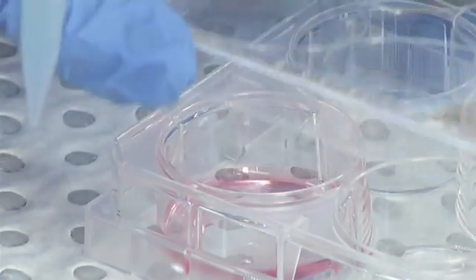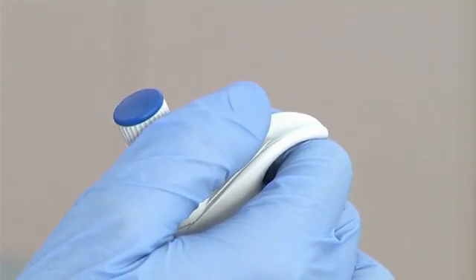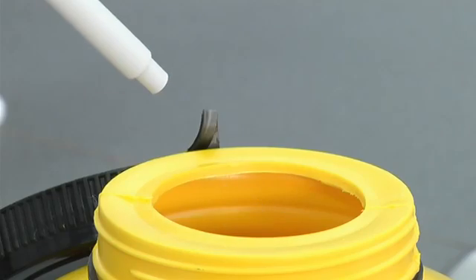You can continue pipetting if you are using the same solution, but if you are finished pipetting or are changing solutions, you can eject the tip into a waste container by depressing the tip ejector.